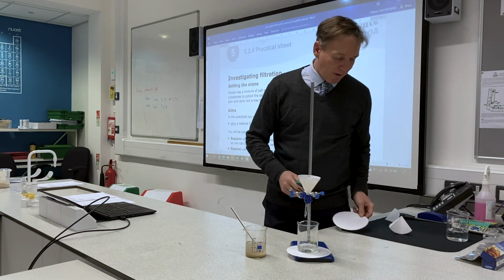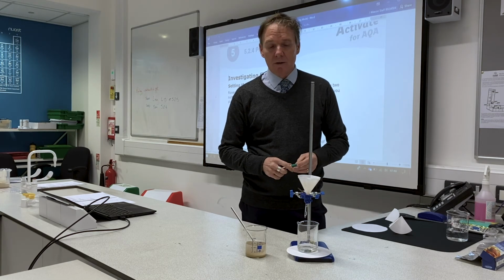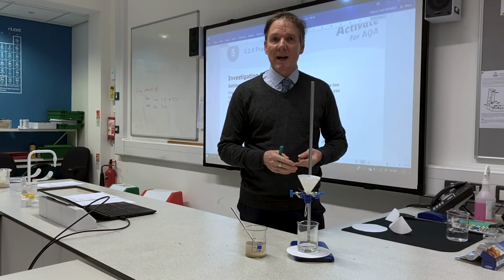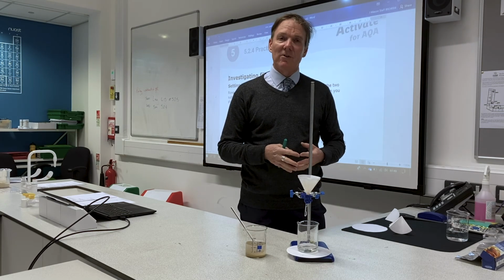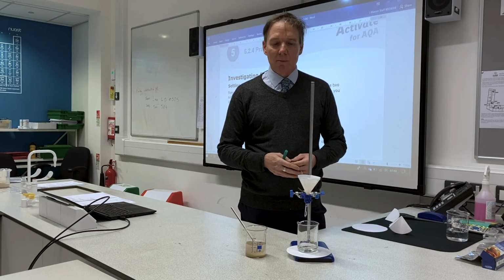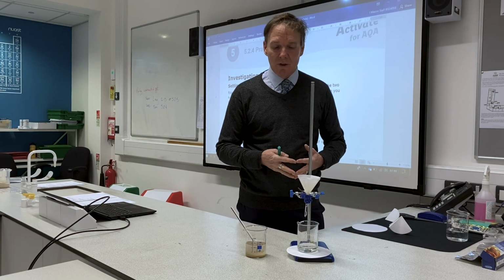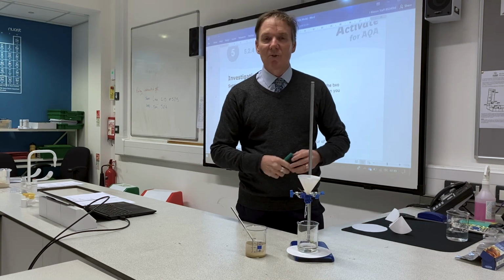All right, now follow the instructions on the worksheet that will be uploaded. Answer the prediction. You need to also write a method. So if you need to look back at this video a couple of times to be able to understand the steps of the method, you can do that. And also you need to draw a diagram on the sheet as well of the apparatus. There is a support sheet that has some pictures of the apparatus that you can use, but you can see from here the apparatus in use, so use that to help you.